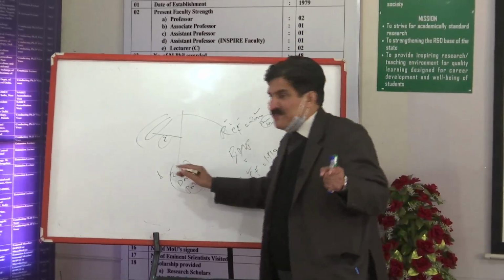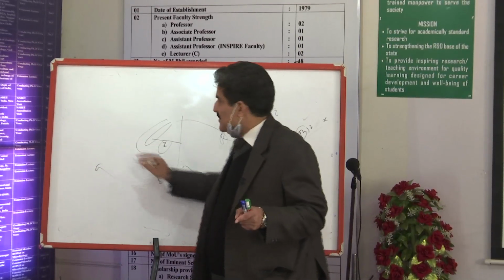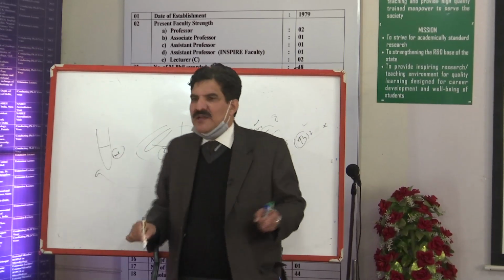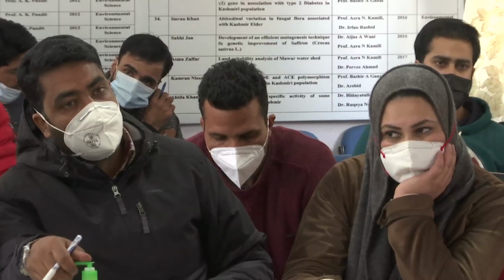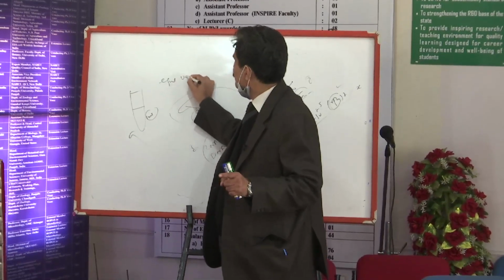Some people, in case of plant systems, use an overnight procedure. Now it is an aqueous solution. Say 1 ml total is coming out, or 2 ml. What is remaining is called the supernatant. Say it is 1 ml or 2 ml, you have to keep that and measure that.